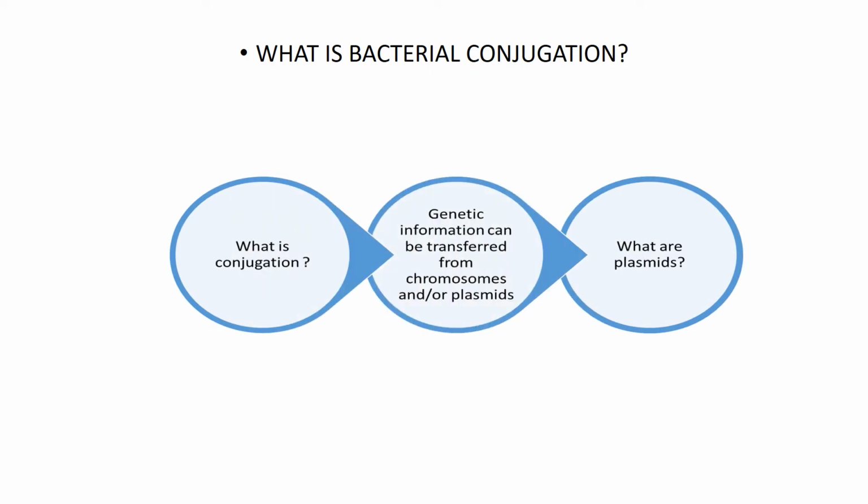What is bacterial conjugation? Your practical session today is based on bacterial conjugation. Conjugation is a mechanism by which DNA from one cell is transferred to another cell to produce a new recombinant cell. Sometimes the DNA that is being transferred codes for antibiotic resistance. This intercellular transfer of bacterial DNA coding for resistance to antibiotics enables the new recombinant bacterial cell to express resistance to an antibiotic to which it was formerly sensitive. This transfer is also considered a type of genetic recombination.